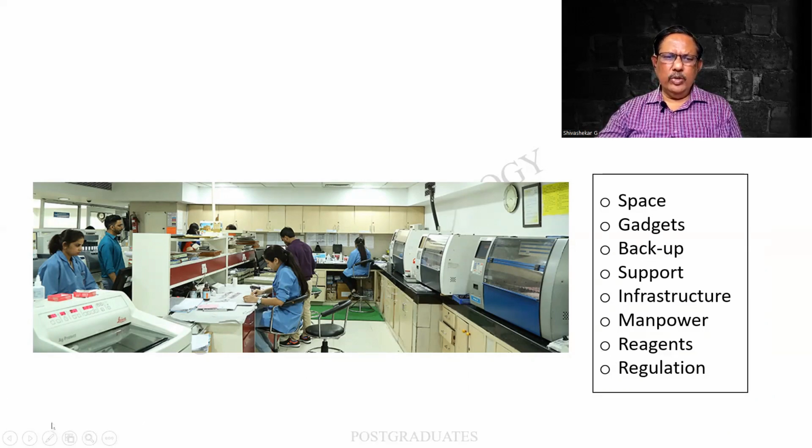And the machines, look at this one. It is so comfortably placed. It is not looking clumsy at all. Well lit, and there is provision for 24 hours of water supply and electricity. So the infrastructure, the manpower, the reagents, the regulation for procuring them and disposing them, all these matter a lot.